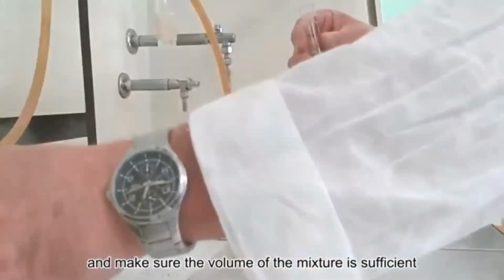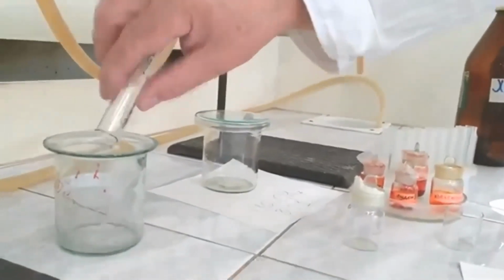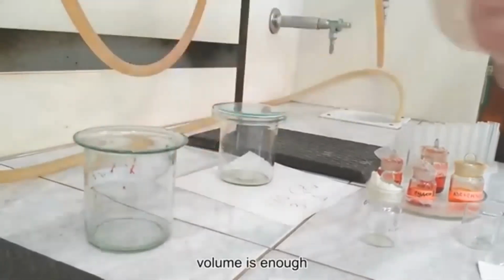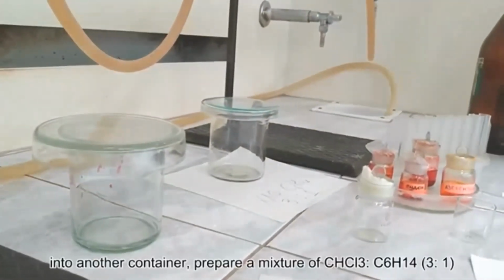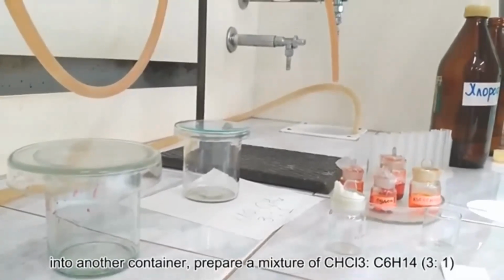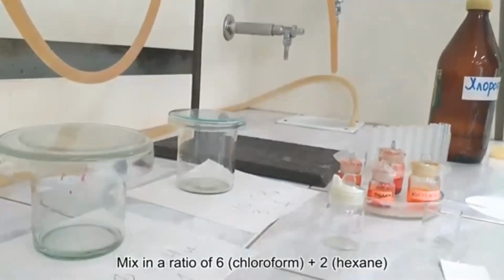Это у нас 1 к 1. Это будет вот сюда. Оп. Перемешали. Но нам хватит 6. Так, а вот здесь 3 к 1. Это всего 4 части. Намешаем. 2 миллилитра гексана и 6 миллилитров хлороформа. 2 миллилитра гексана.